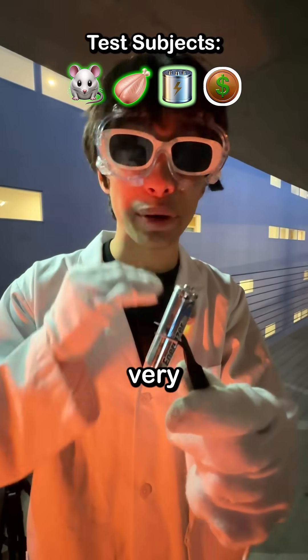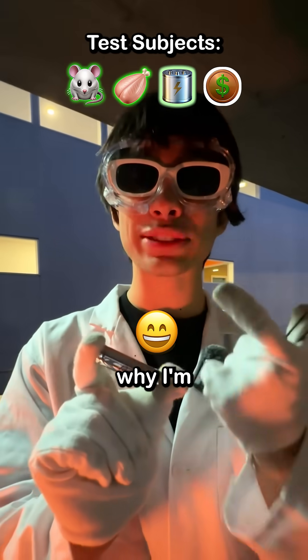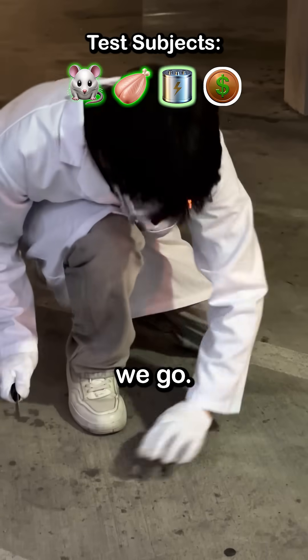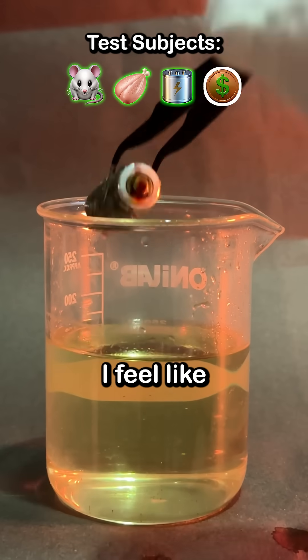But what about a lithium battery? This is very dangerous, since the metals inside react explosively with nitric acid — so that's why I'm testing it. I made a small hole to let the liquid in. When I dropped it in, nothing happened. Someone tell me why, because I feel like an idiot.